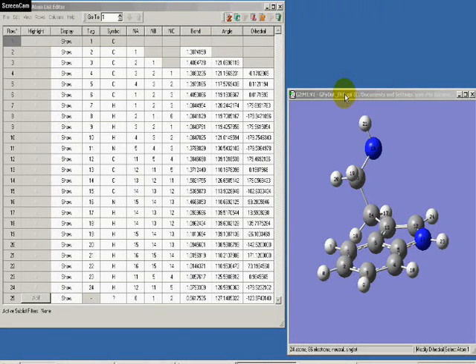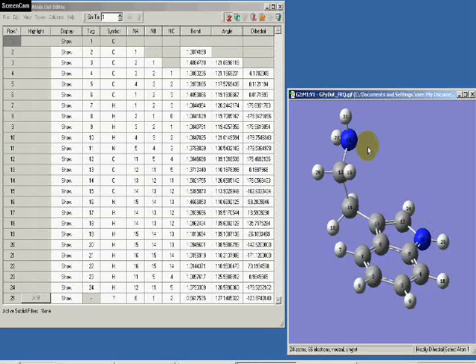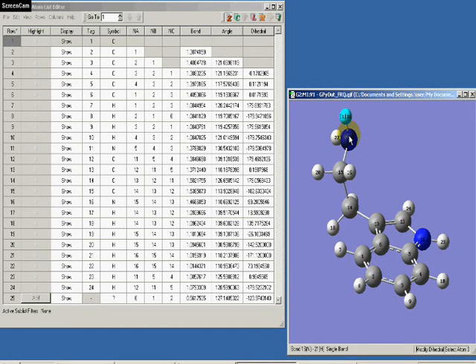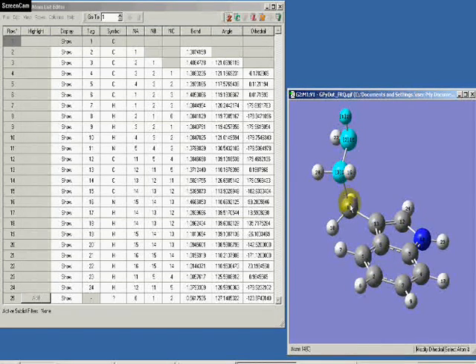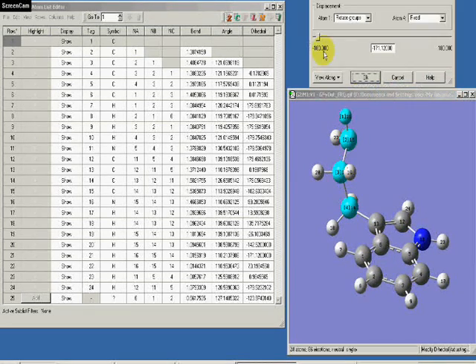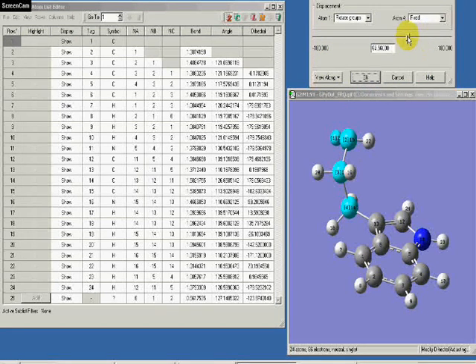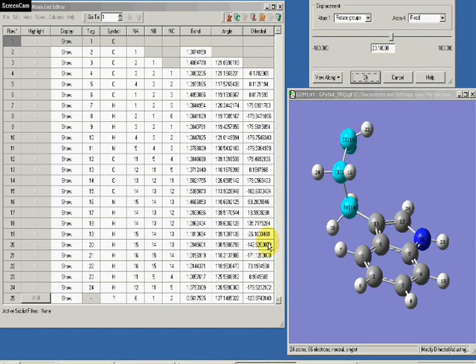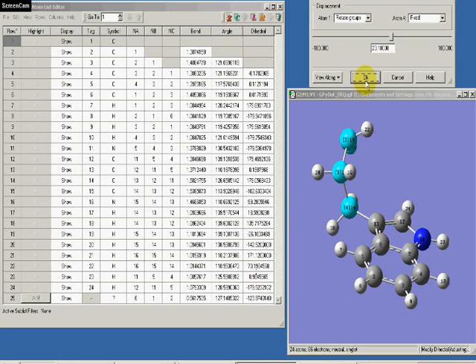For example, OK, and I'll do it again just to show it, and once again I will twist it quite a lot, and you will see that more than one angle is changed here.